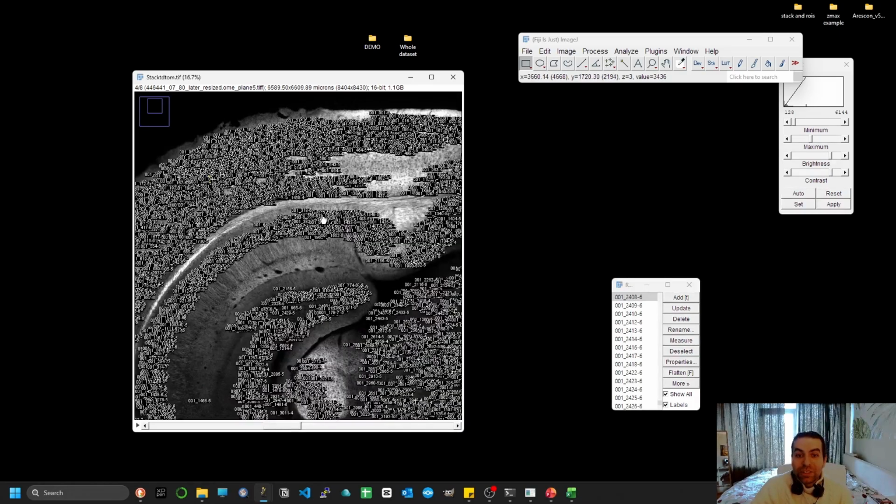Alright, so that's how you get your files, and if you're using cellular signal as well, like CFOS, EGR2, ARC, whatever, you will also get quite good filtering. I hope so, at least. You should. And the filtering there, when it comes to the crispiness measurement that I mentioned also to the decision trees, is based on the mean value for the nuclei and the fine edges for the cells.